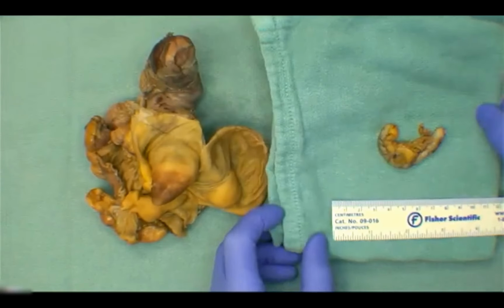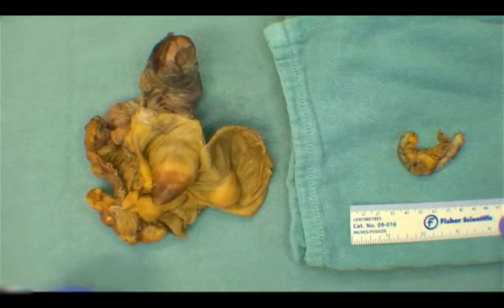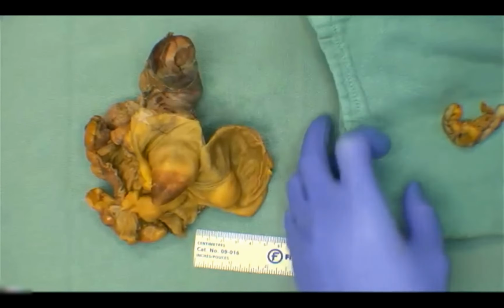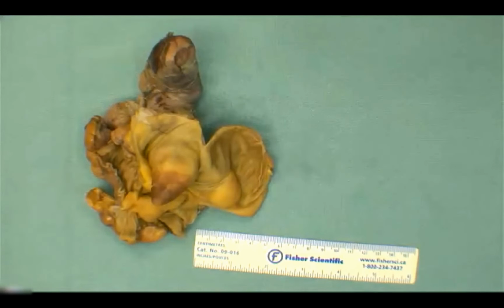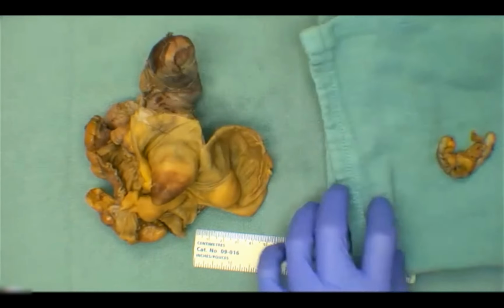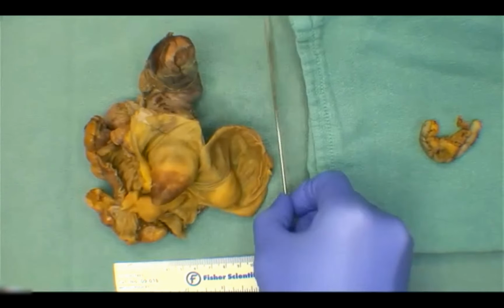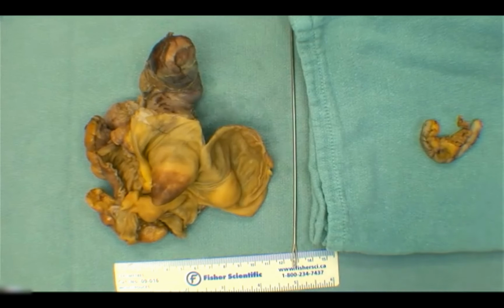I think it's pretty dramatic from what we're seeing between the two, but this is a really nice example of an appendix. And for fear of being shamed, I'm just going to move this out of the frame. I put it on a separate towel, so hopefully I'm not getting too much judgment. It's just technically on a different stage. Here, I'll put a probe and we'll put our invisible force field between the two.